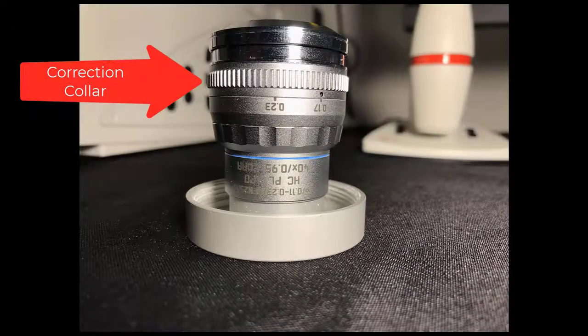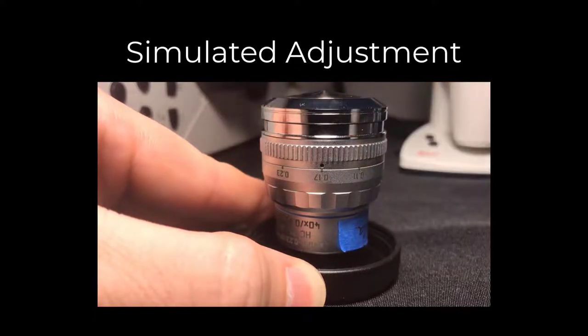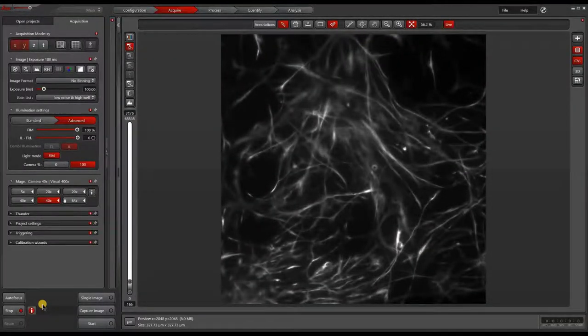The next objective we'll look at is a 40x high NA objective which has cover slip correction. It has markings of 0.11, 0.17, and 0.23 millimeters — these values represent the thickness of the cover slip being corrected for. As with the 20x, this is an example of the ring being twisted. We'll focus onto the sample and take an image for comparison after the adjustment.